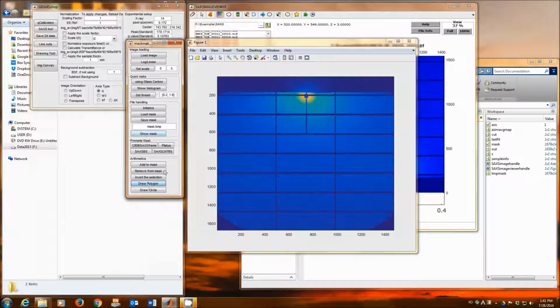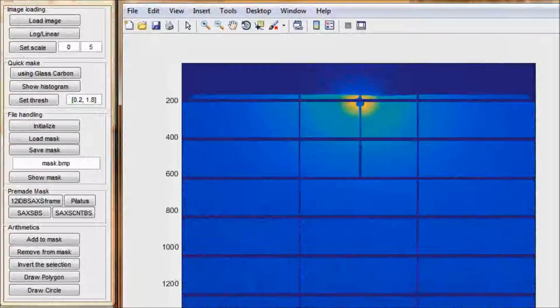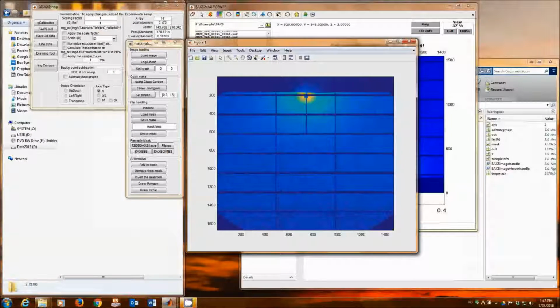We're going to draw a polygon. So like starting from here, go there. Okay, like this. Well, you can zoom it in. So as you see, whenever I click the mouse, it actually draws a blue line, which is a little bit difficult to see, but eventually, okay. So like drawing like this, you can draw an arbitrary line.